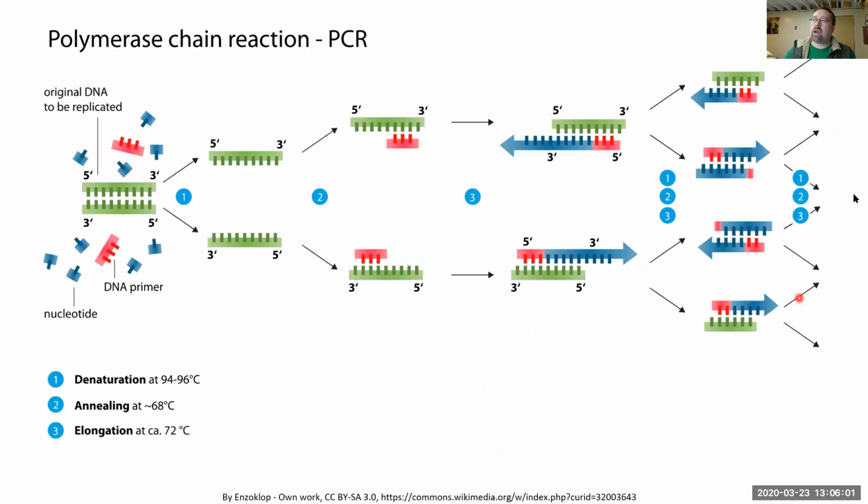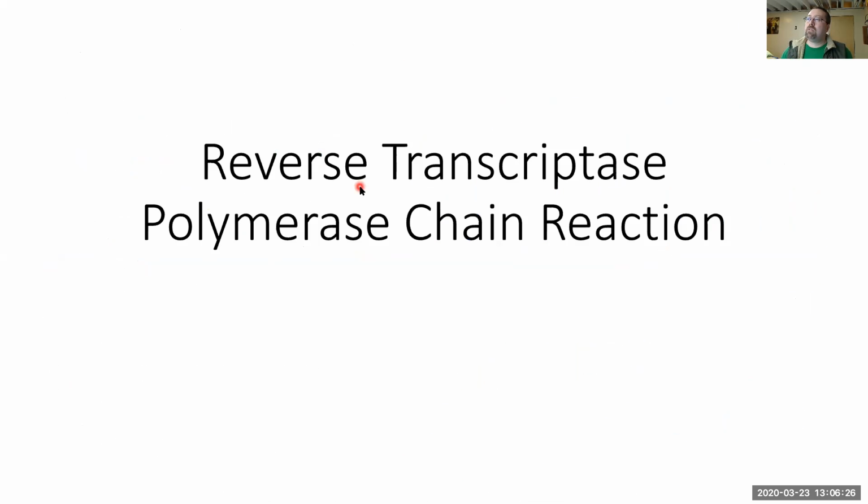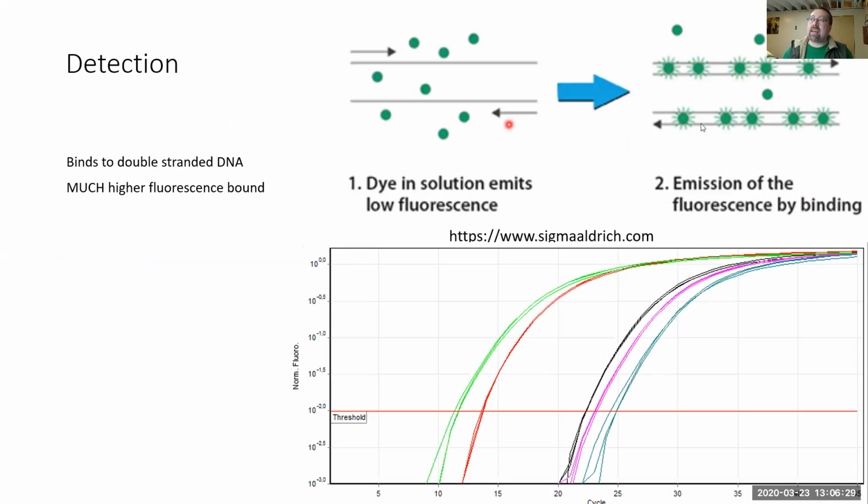So when we're talking about this amplification, we will go through one whole cycle of denaturation, annealing, and elongation. And before we go back to denaturation, on real-time PCR, we will have a fluorescence reader read how much fluorescence is in each tube and give you a number for that. Then it will go back to denaturation. The dye that was bound will fall off again because the bonds have melted and we don't have double-stranded DNA anymore. So it's real time, that instant, how much DNA is there, and then it falls apart again, which is pretty cool.